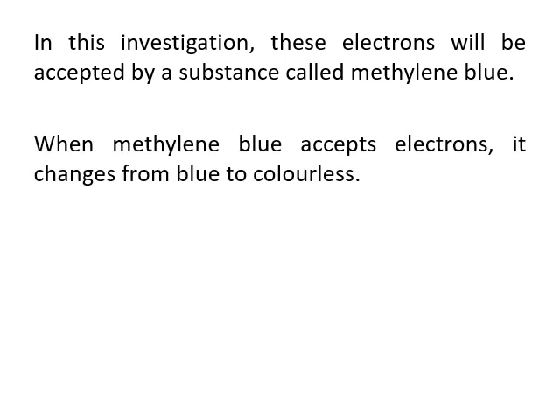So the logic is, if the yeast that it's mixed with are respiring, then there will be electron movement. Now this means that the methylene blue will be able to accept these electrons, or at least some of them, and start to become colourless. And from this we can gauge the rate of respiration, because obviously if respiration is happening at a faster rate or a greater rate, we would expect the time taken for the methylene blue to become colourless to be much quicker. So a shorter time to go from blue to colourless. So this is how we are going to measure the rate of respiration in this investigation.